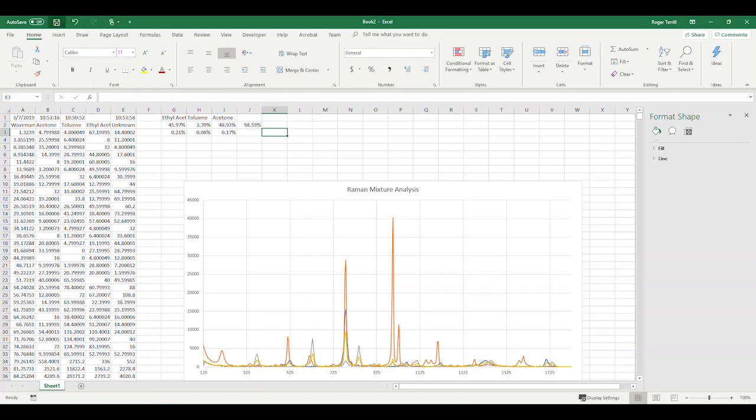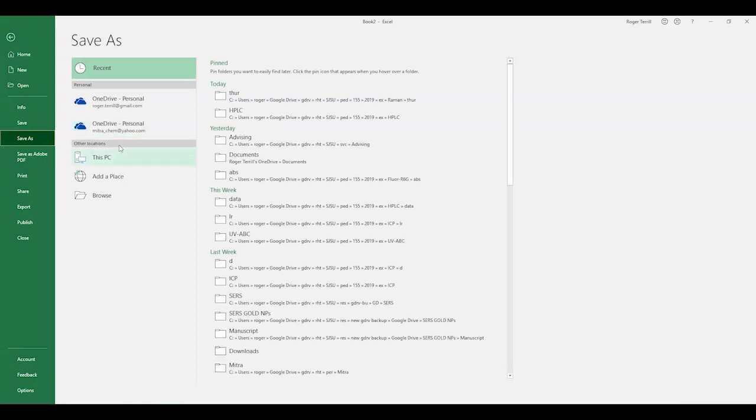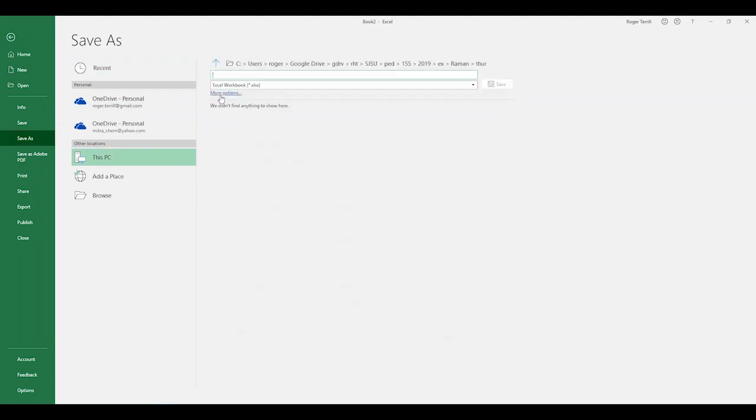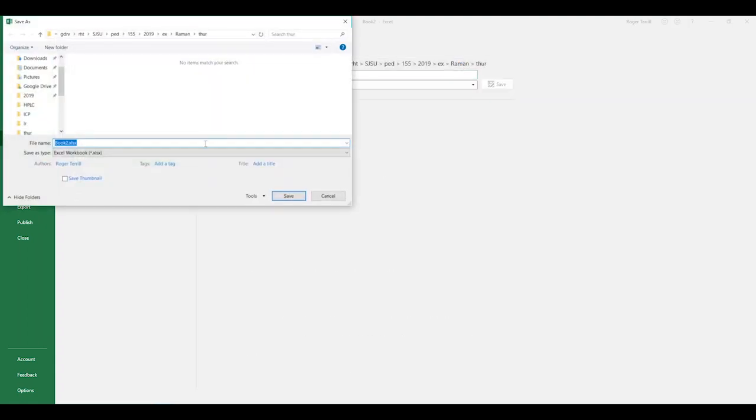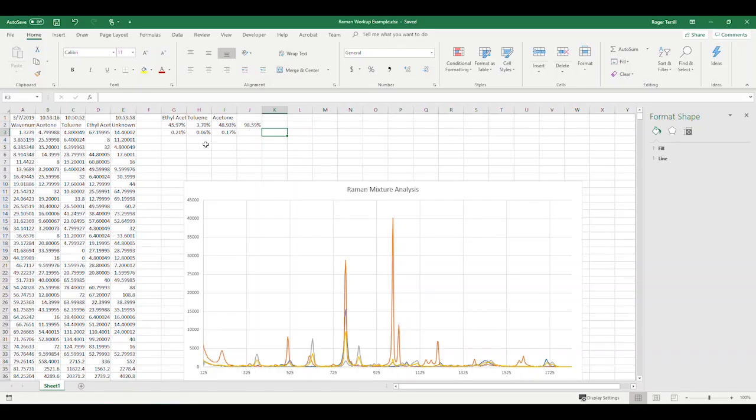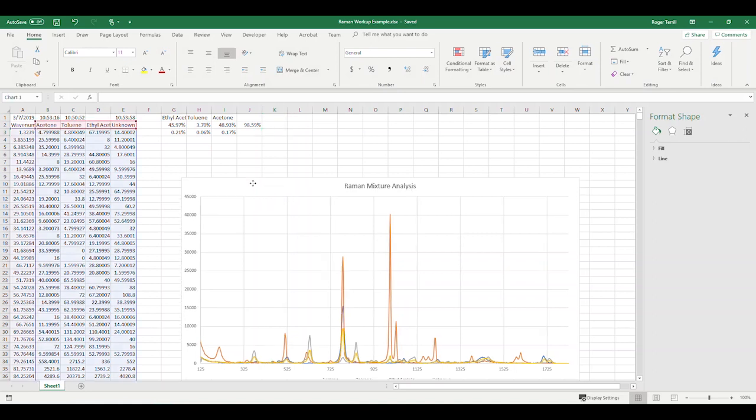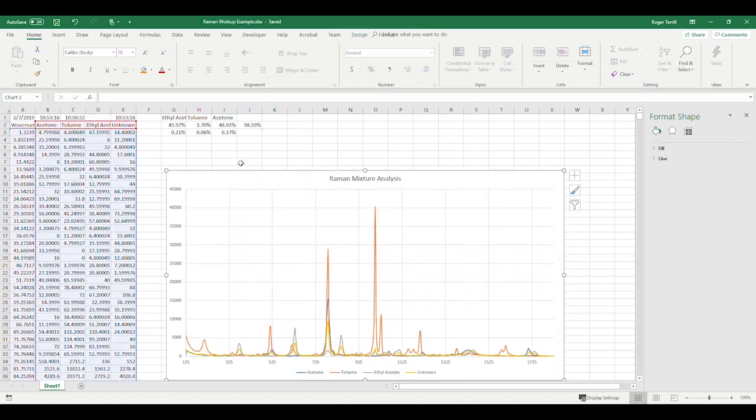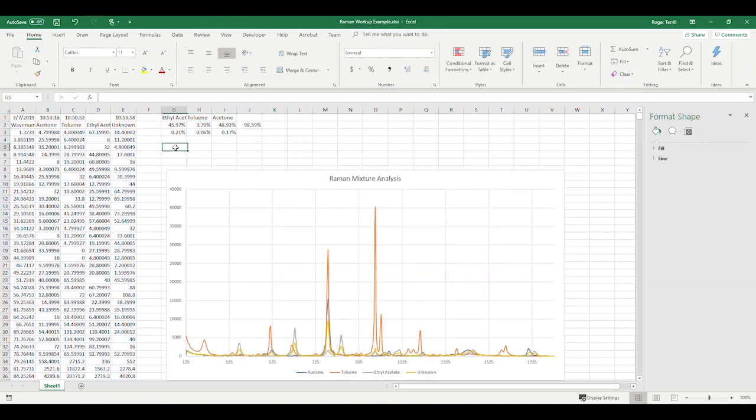So we'll save this guy. And I will go to this Persher Raman. This is going to be the Raman Workup Example. So now, what are we going to do with these data? So we have the coefficients. Now we need to modify the graph a little bit so that it shows these various aspects.